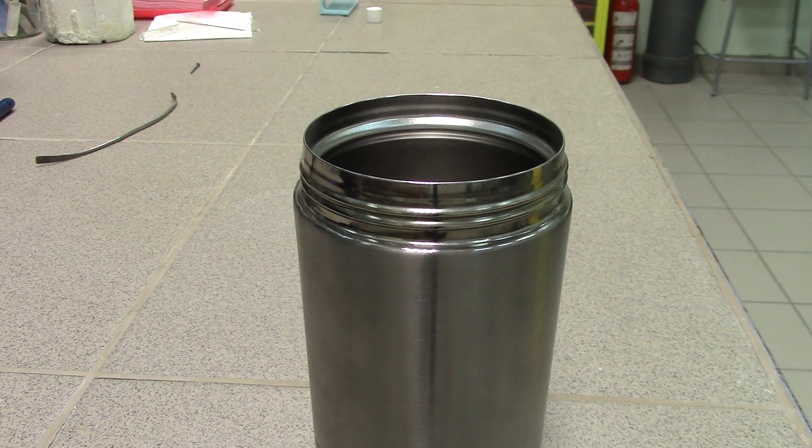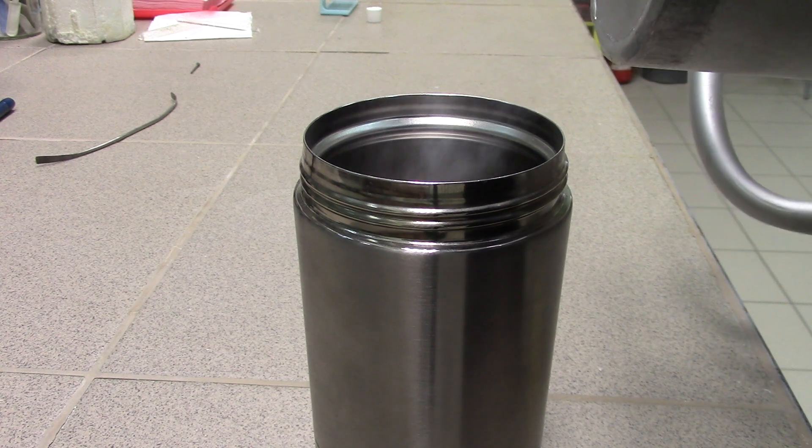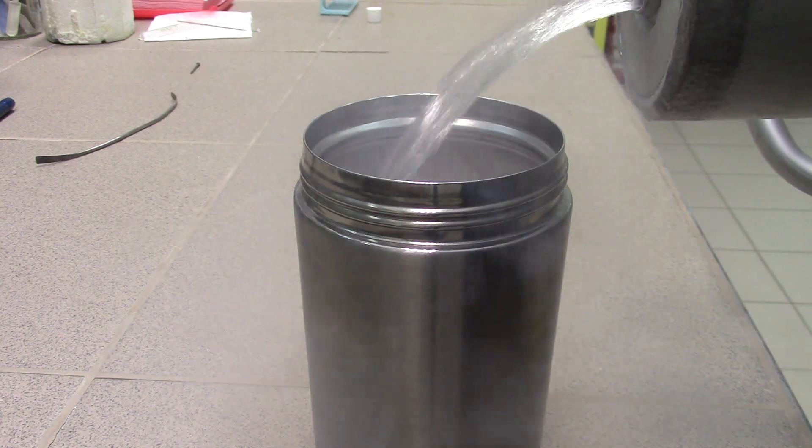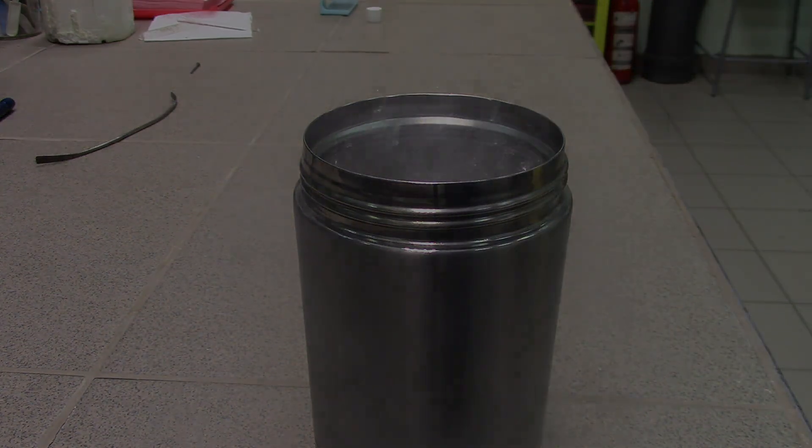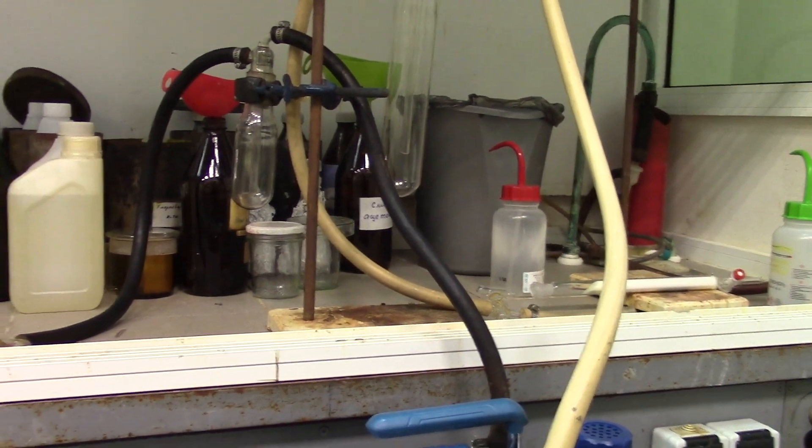Further we need a thermos of liquid nitrogen for trap which prevents a vacuum pump from moisture and fumes. Now let's go to set up the whole construction.